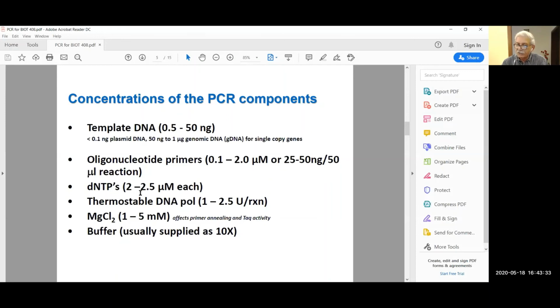So this is our stock. The actual stock is 100 millimolar. This is our secondary stock. Then we make a tertiary stock. We have 100 microliter now of 25 millimolar each. We take 20 microliter out of it and make a 1 to 10 dilution. We add 180 microliter of water to 20 microliter. So what will be the final concentration of the 4 dNTPs after a 10-time dilution?